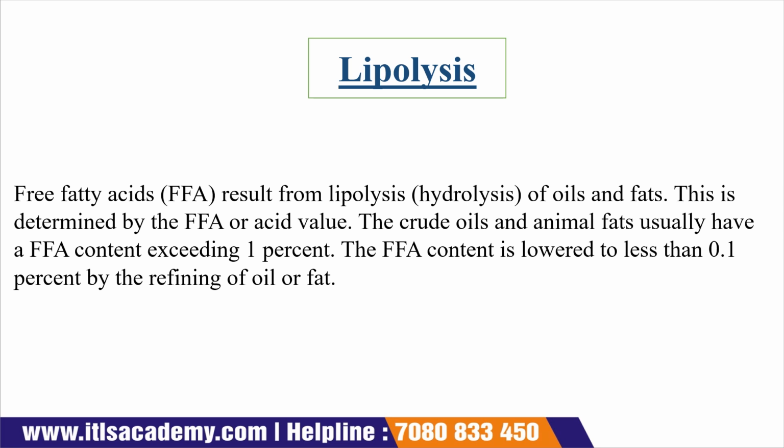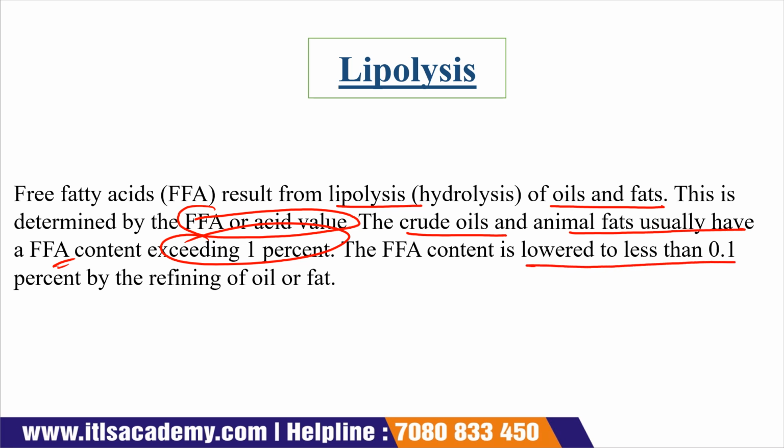Lipolysis. Okay, so lipolysis is used in case of free acid resulting from lipolysis of oil and fat. This is determined by the free fatty acid or the acid value. The crude oil and the animal fat usually exceed 1% of free fatty acid, and the free fatty acid is lower, less than 0.1%, in case of refining of oil or fat. When we refine the oil or fat, the concentration of the free fatty acid also decreases in case of refined oil or fat.